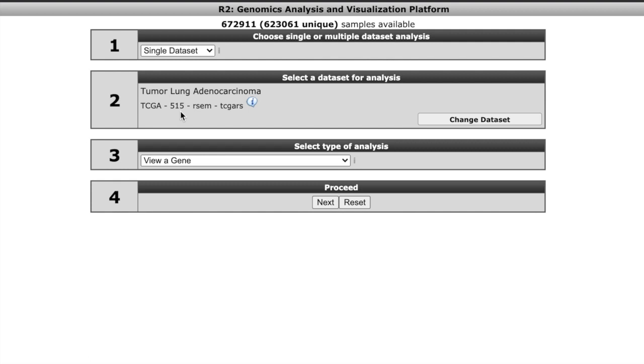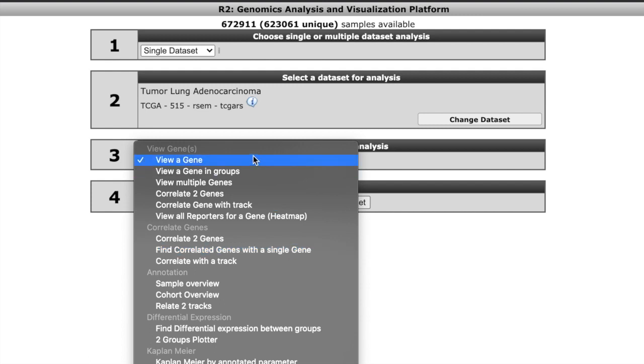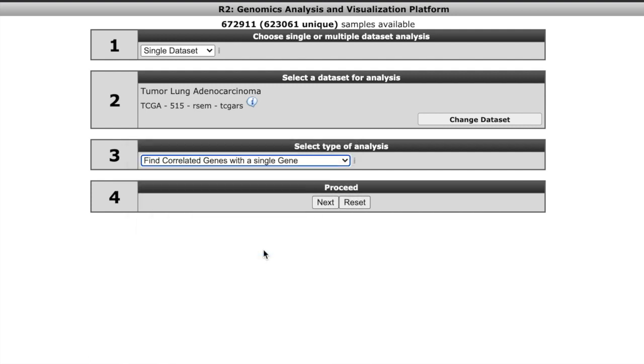Now what we're going to do is down here, this type of analysis, I want you to put find correlated genes with a single gene. Not in the view genes category, in the correlate genes category, I want you to say find correlated genes with a single gene. Click on that. Everybody has bookmarked this page, right? So I'm going to hit next.